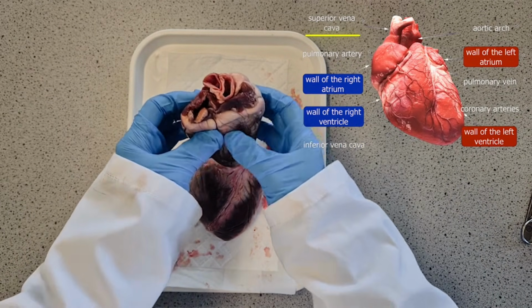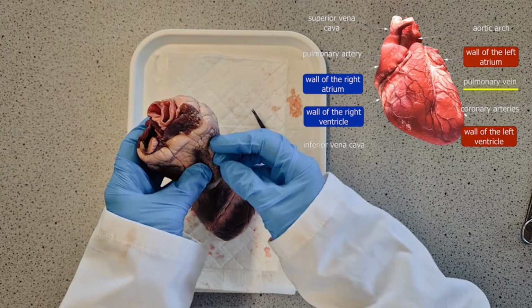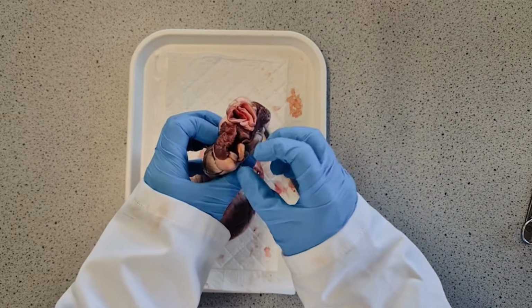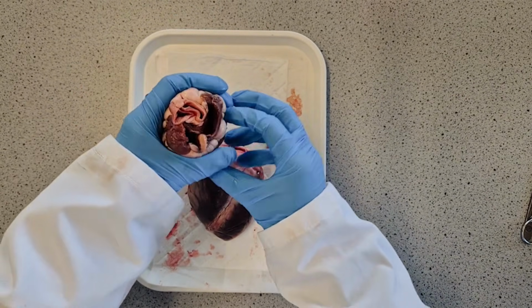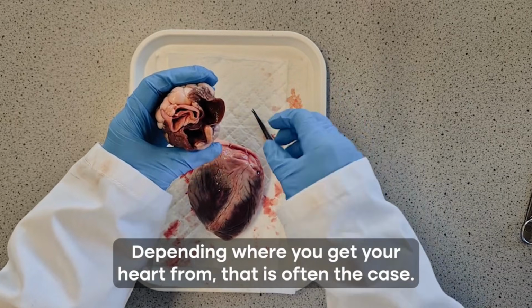The vena cava would be the vein that's going into the right atrium, and the pulmonary vein would be the one that's going into the left atrium. But we actually can't see these because we can see there's actually been an incision already into the atria for the heart at this point, which is often the case. And I can see here, I've got an incision here where, depending where you get your hearts from, that is often the case. So just make the students aware.